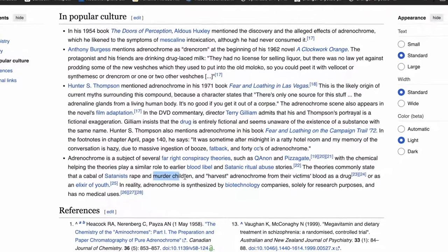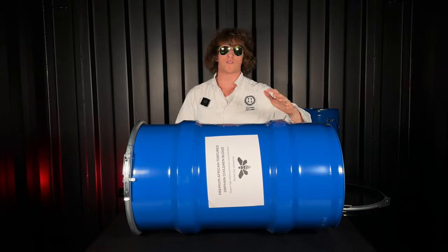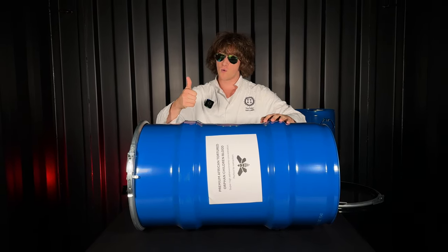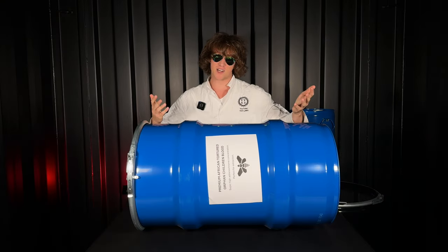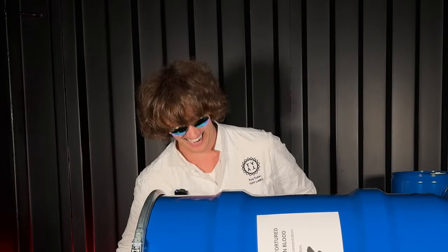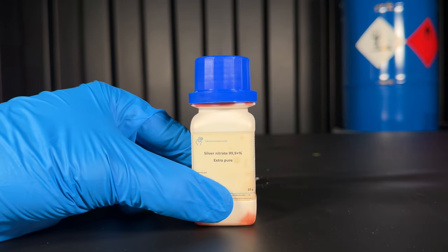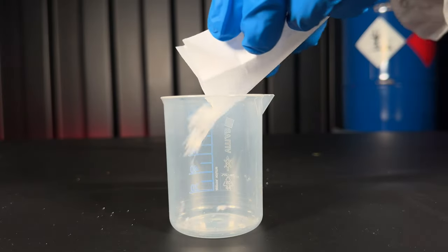With all of the mysteries surrounding Adrenochrome, it would be fun to try to make some. So to make Adrenochrome I bought 50 liters of premium quality tortured African orphan children blood and let's go! Okay, actually I'm gonna use something else. For the reaction I will need a fancy oxidizing agent called silver oxide and as I don't have any, I'll make it myself.